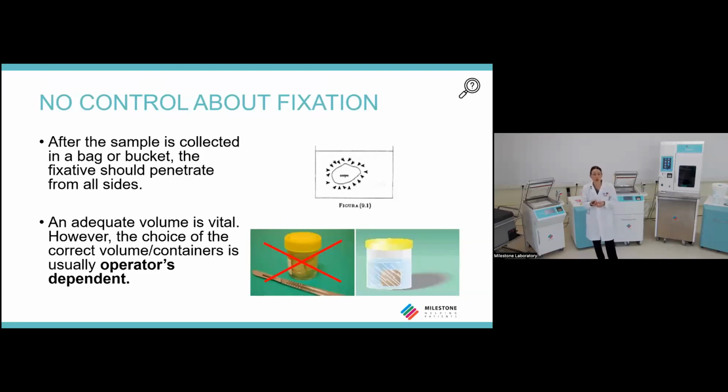Another consideration is the biohazard. The feeling if you receive a specimen in formalin is, I'm safe because the tissue is in formalin. The reality is that the formalin penetration at ambient temperature is about 1 millimeter per hour. So for surgical specimens, the biohazard risk will for sure be present, even if you receive them in formalin, because in the center of the specimen, you will for sure have blood.